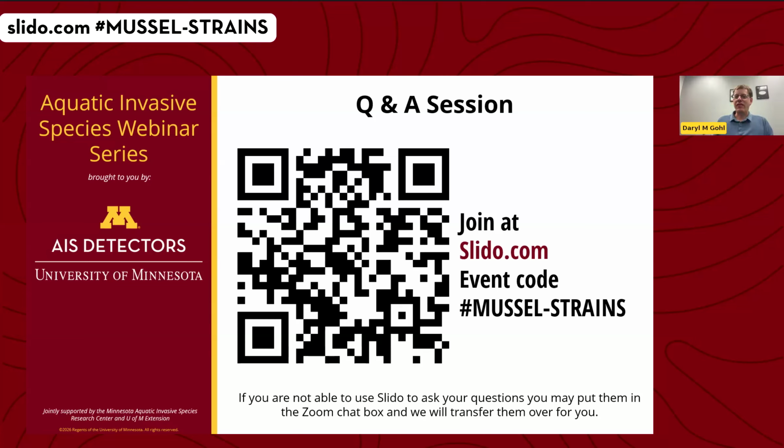Yeah, I can maybe take the first stab at it, and then I'll let Victor weigh in. But right now, the MDA is really targeted at a pure sample. So, the challenge with the eDNA samples is that you've got a mixture of everything that's in the environment, right? And so one couldn't necessarily take an eDNA sample and then do this sort of genotyping, or at least you would get a mixture that would be much more difficult to interpret.